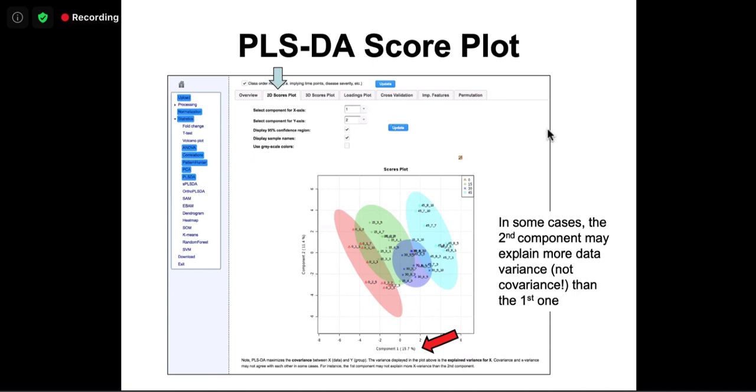I think part of the problem with PLS-DA and PCA is that we can bias people's perception. What we're showing here are colored ellipsoids. If we remove the colored ellipsoids, people might not agree that there are four groups. They might not even be able to see clear separation between at least three of the groups. So I think there is something to be said for providing a more robust assessment of the grouping, because we can color all we want, and by creating certain sized ellipsoids we can bias the perception of clustering. In the end, you want some statistical test or mathematical rationale to say why I see four groups here rather than three or two.